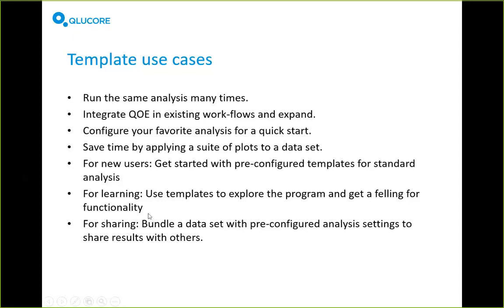Any sort of file can be bundled with a template, and one very reasonable file type to bundle is a GE data file or an Omics Explorer data file. You could take a dataset, store it inside a template, and create code that opens it and sets it up in a certain way. This means you bundle it into one single file and share it with your colleague, and they can run that inside Omics Explorer.